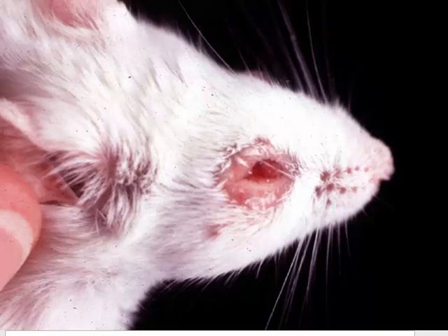I did mention how immunodeficient mice get an increased amount of blepharitis, and this is not only because they're immunodeficient and have decreased cell-mediated immunity and a decreased ability to fight infection, but also because they're hairless. They're not truly hairless. Hair comes out, but as it emerges, it tends to break off. And nude mice don't have eyelashes, and eyelashes are the first defense against ocular infections. They tend to have an increased amount of foreign material which gets into their eyes and sets them up for various forms of blepharitis.